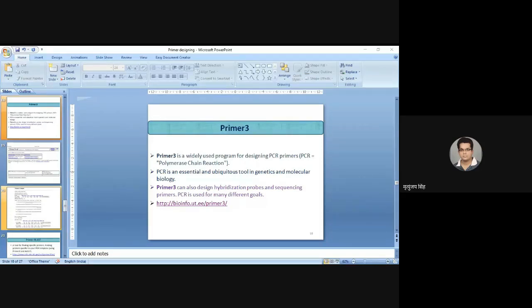Now, like this sequence, which I copied in Word, is the first exon sequence with some nearby sequences. The red sequences are exon sequences, and the rest are nearby sequences, because I want my primers in the nearby sequences to amplify my exon completely. So I select this 335 base long nucleotide sequence, of which 255 nucleotides are the exon 1 region. Just copy it in this box, and if you have any characteristics you want to change, because it is all auto-selected, you can change them, but you must have specific information about that.